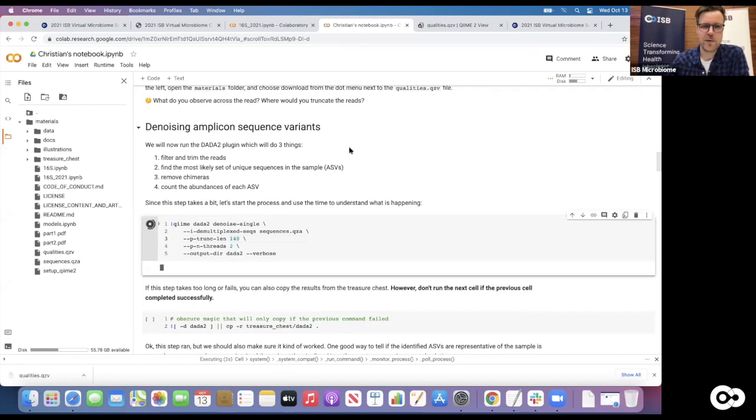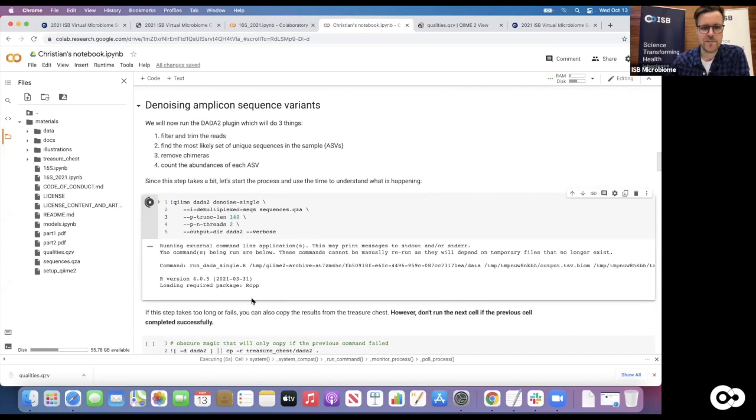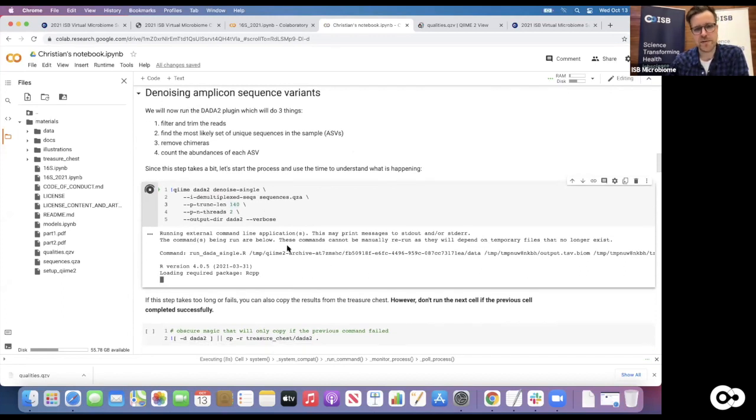While that will start now, it will also take about 10 to 15 minutes. And there's a lot of output. You don't have to be scared of it. It's just informative. There won't be anything bad happening.